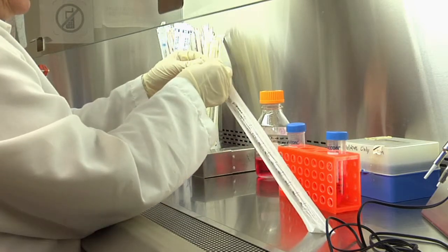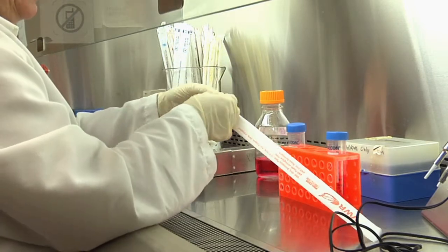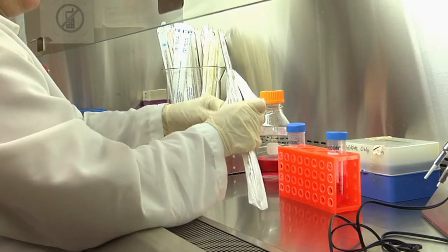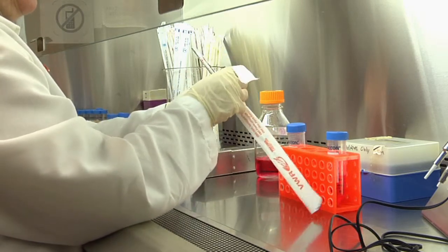Unwrapping sterile pipettes is an art. You should remove the paper wrap without touching the portion located towards the tip of the pipette that will be later on in contact with the sterile liquid.